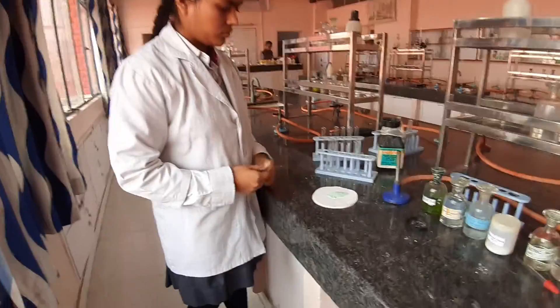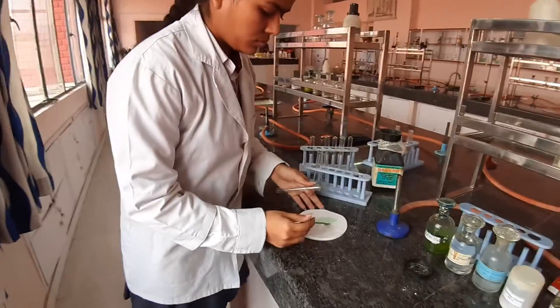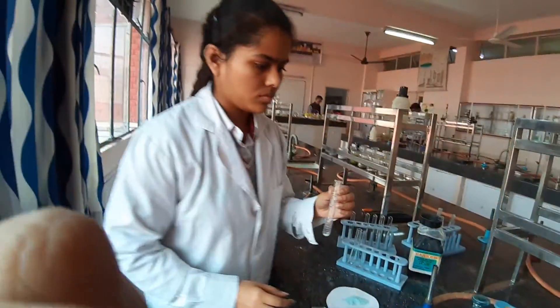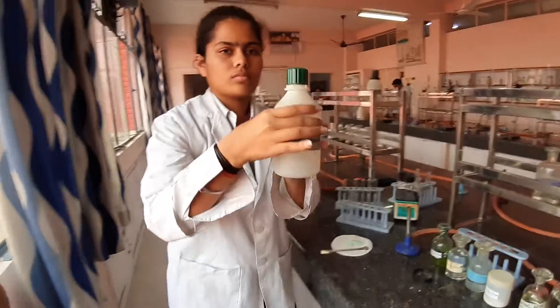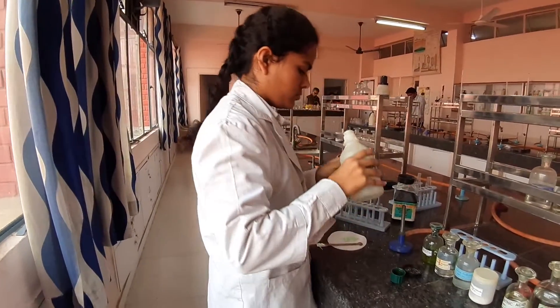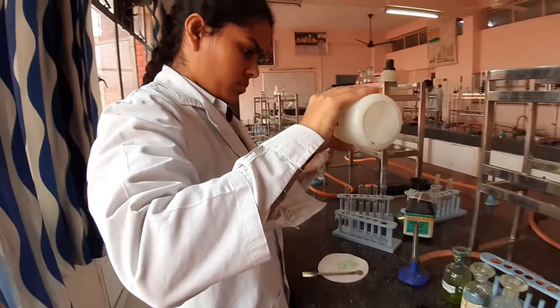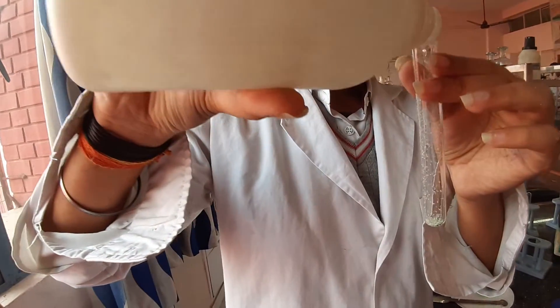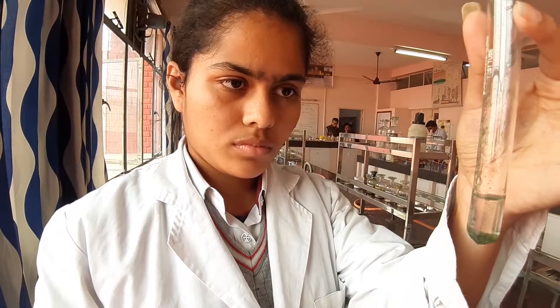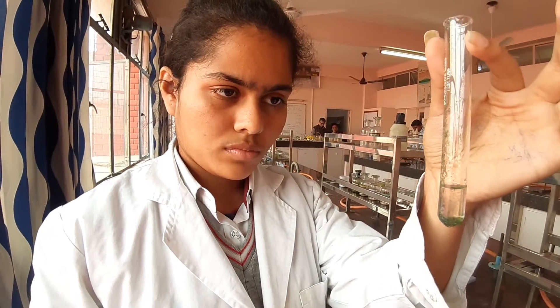Let's begin with the cation analysis. We'll start with zero group. For zero group you need to take a test tube, add a pinch of salt. To this you have to add any OH solution, and observe whether there is any gas evolved or not. Have a look — there is no gas evolved, which shows zero group is absent.